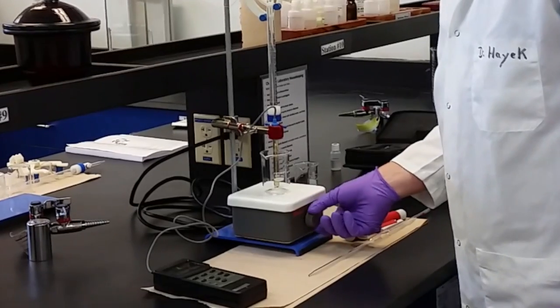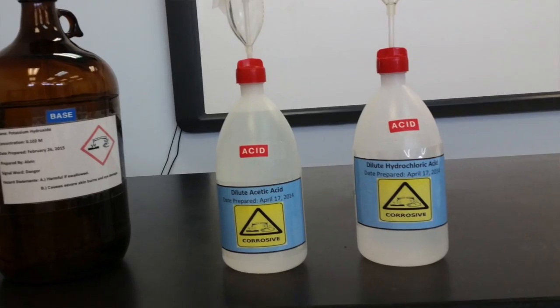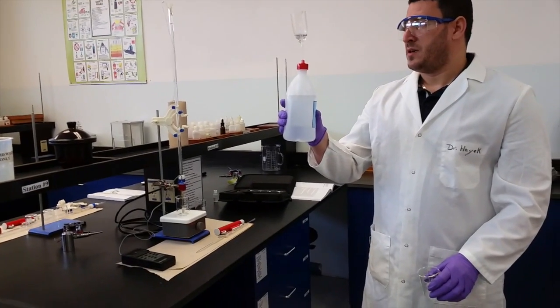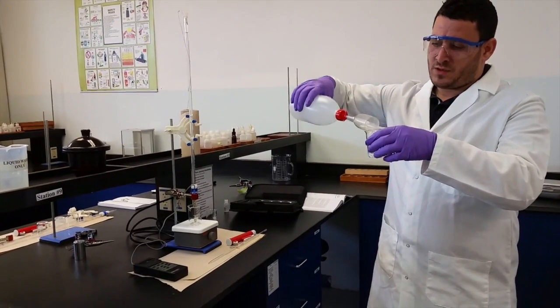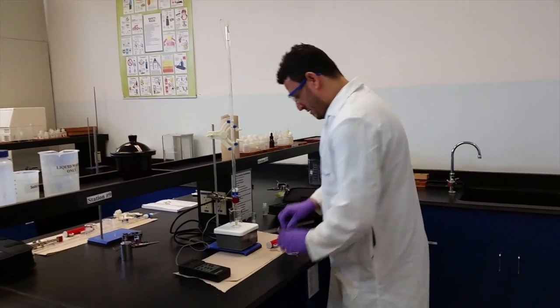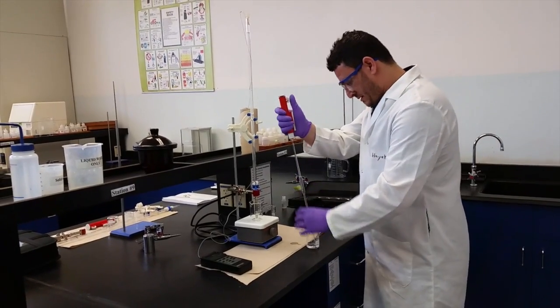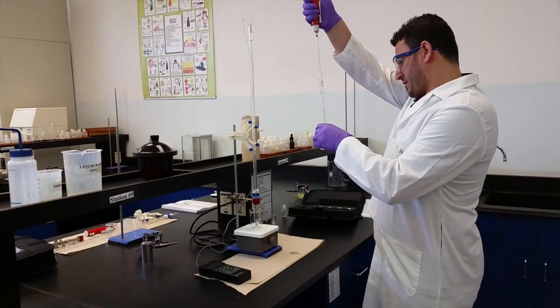Now, we'll collect our acid. We'll start first with the hydrochloric acid. So you will need 10 milliliter. Squeeze it up till like 15. Transfer it to the beaker. Now using the pipette, you collect exactly 10 milliliter of the strong acid.